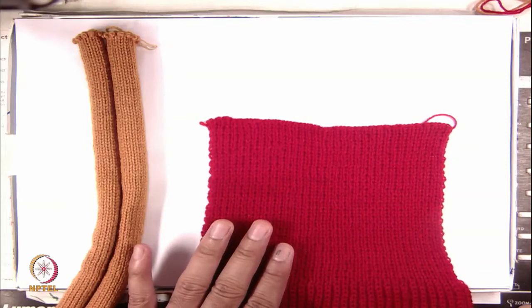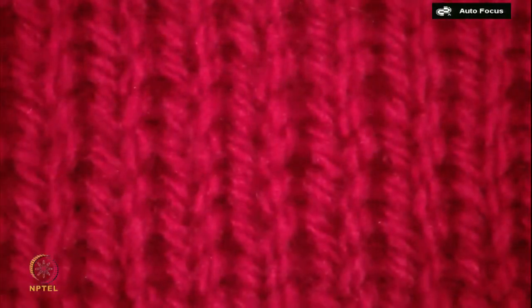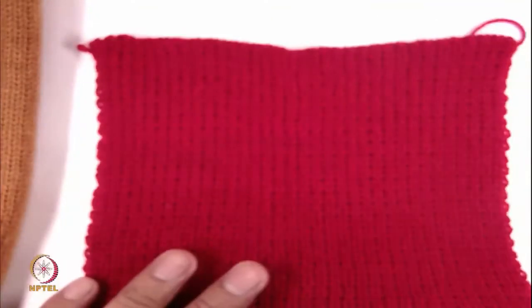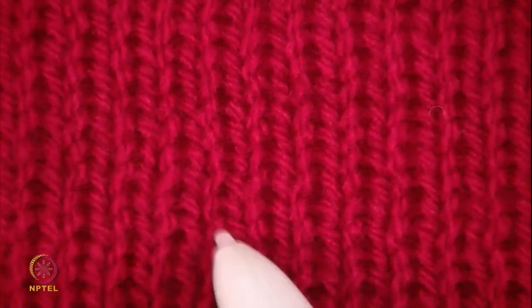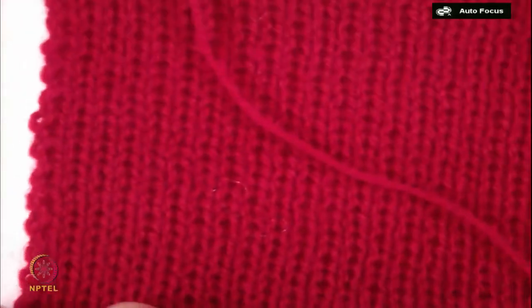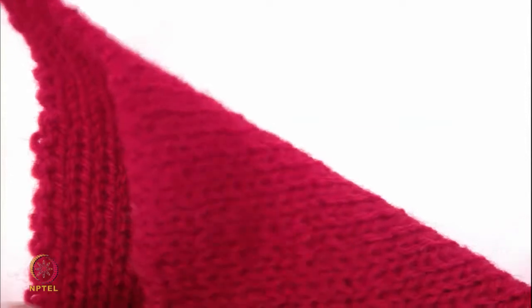This one is the double jersey structure. If you look at this fabric, as I mentioned, on the technical front side you can only see the technical front side of the loop. So you can see this is the leg part of the fabric. Let me show you the technical front part. Each loop, this is your leg part. If you reverse this fabric, again it will look similar. You can only see the technical front on both surfaces. On this side also, technical front.